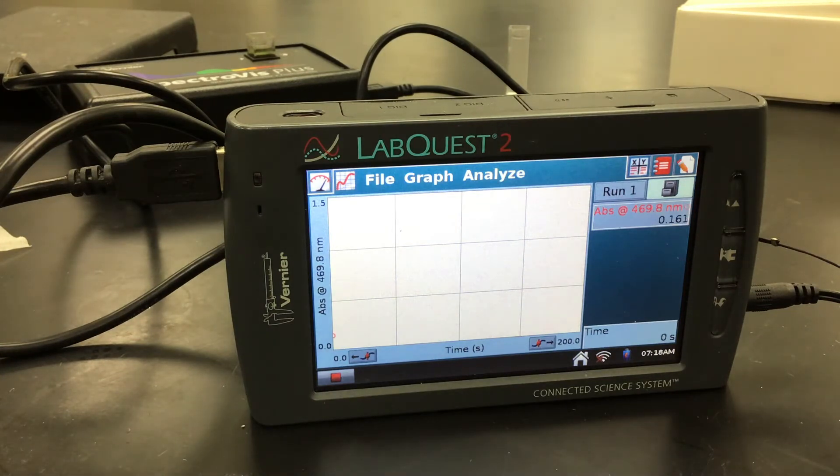So it's real important. I don't want to necessarily rush when I'm collecting my data, but you know, you don't want to ever want to rush in a chemistry lab. But at the same time, we want to be sort of in the same rhythm so that it eliminates any inconsistencies when we're collecting our data, especially since our solution is getting darker.